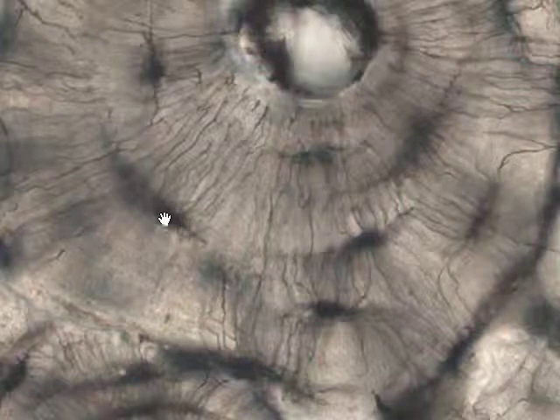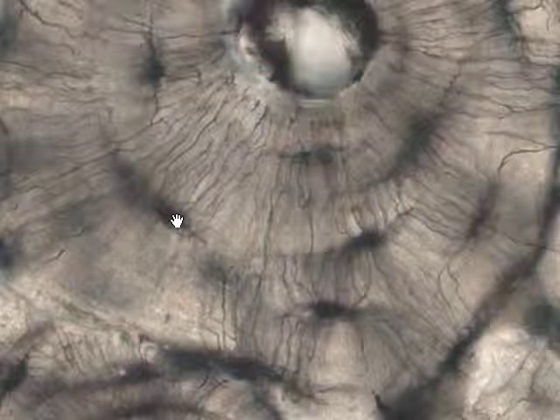Each of these osteocytes trapped in its lacuna extends thin tendril-like processes out through the bony matrix in small canals called canaliculi. And these processes make contact with, and if you like, speak to the surrounding osteocytes. So here's an osteocyte. Here are the processes extending out in the canaliculi.